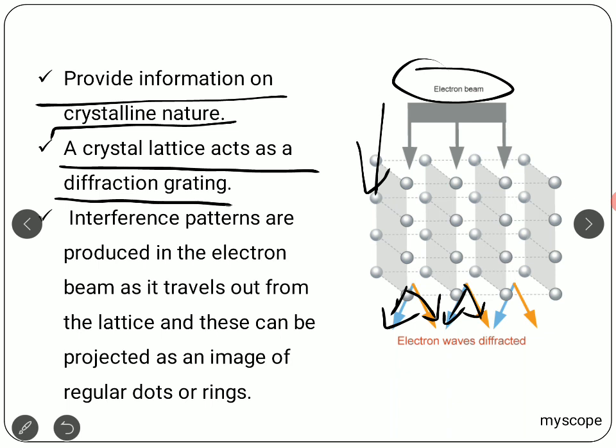So you know about grating and slit. If you have a very small opening, it is called a slit, and if you have a number of small openings, this combines to a grating. So if we have a sample with the atoms arranged, the diffraction can occur at each of these points. So it combines to form a grating.